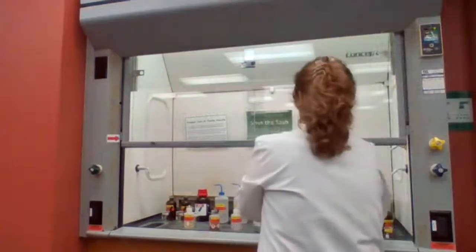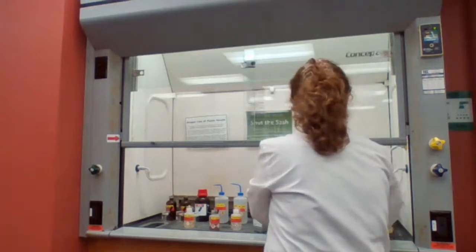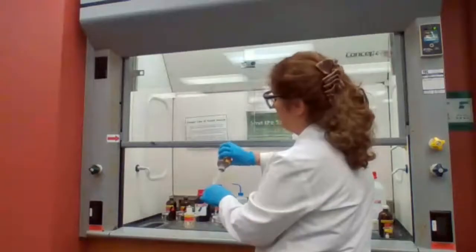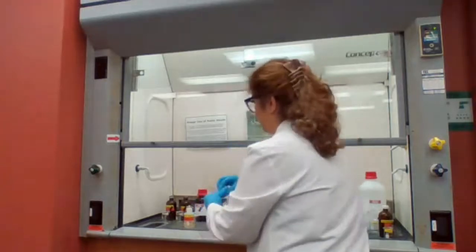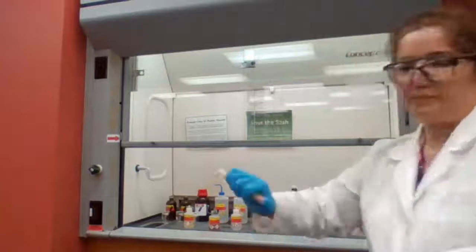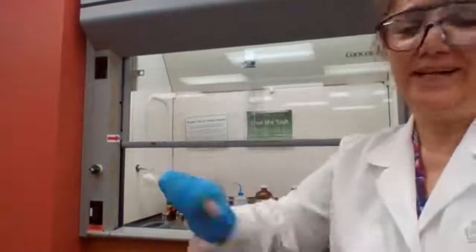How is this not working? Add some more of the silver nitrate. You should be able to see the precipitate. You asked me to slow down, and this experiment is making us very slow. So you probably want to move to the next step now.